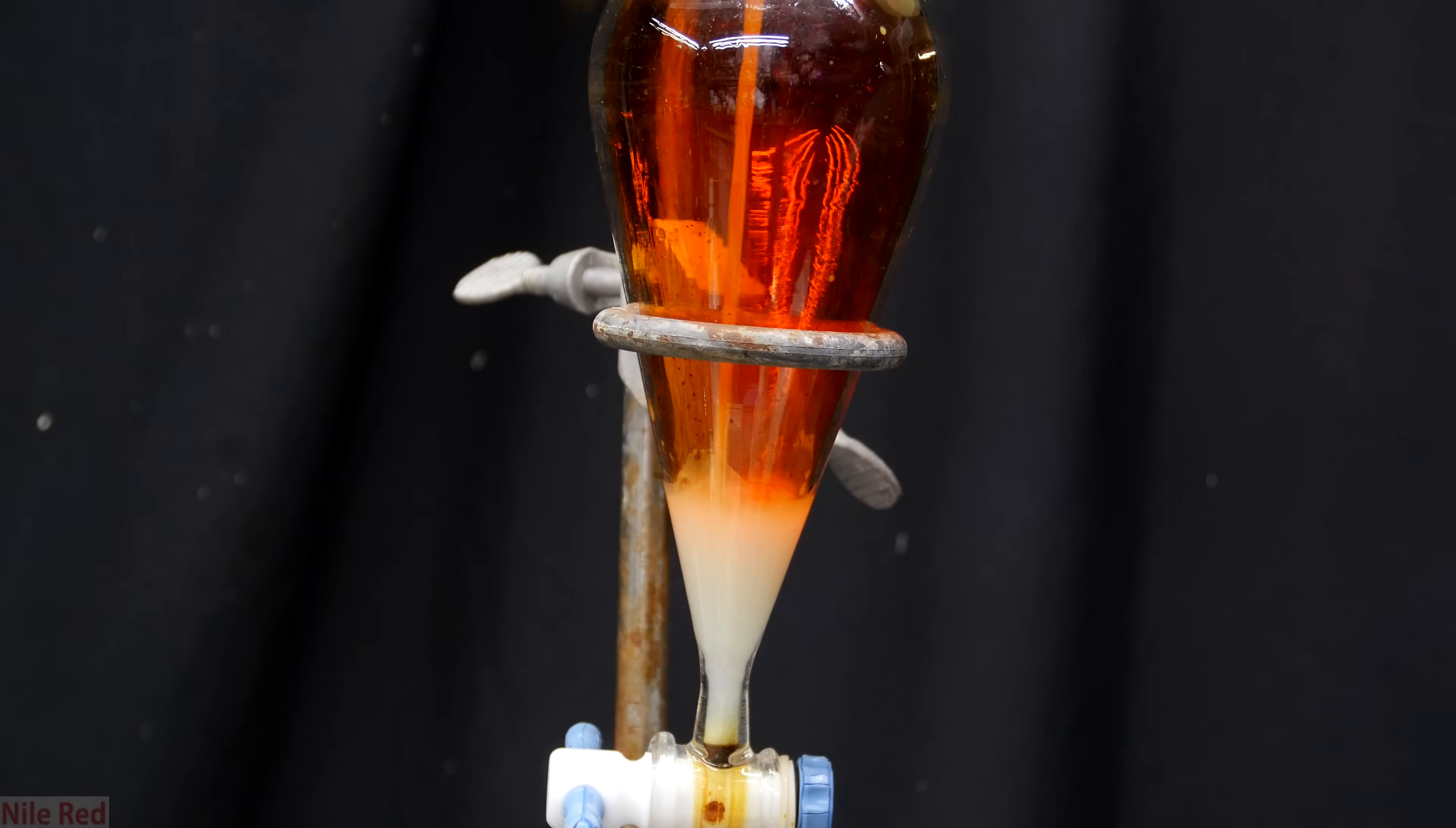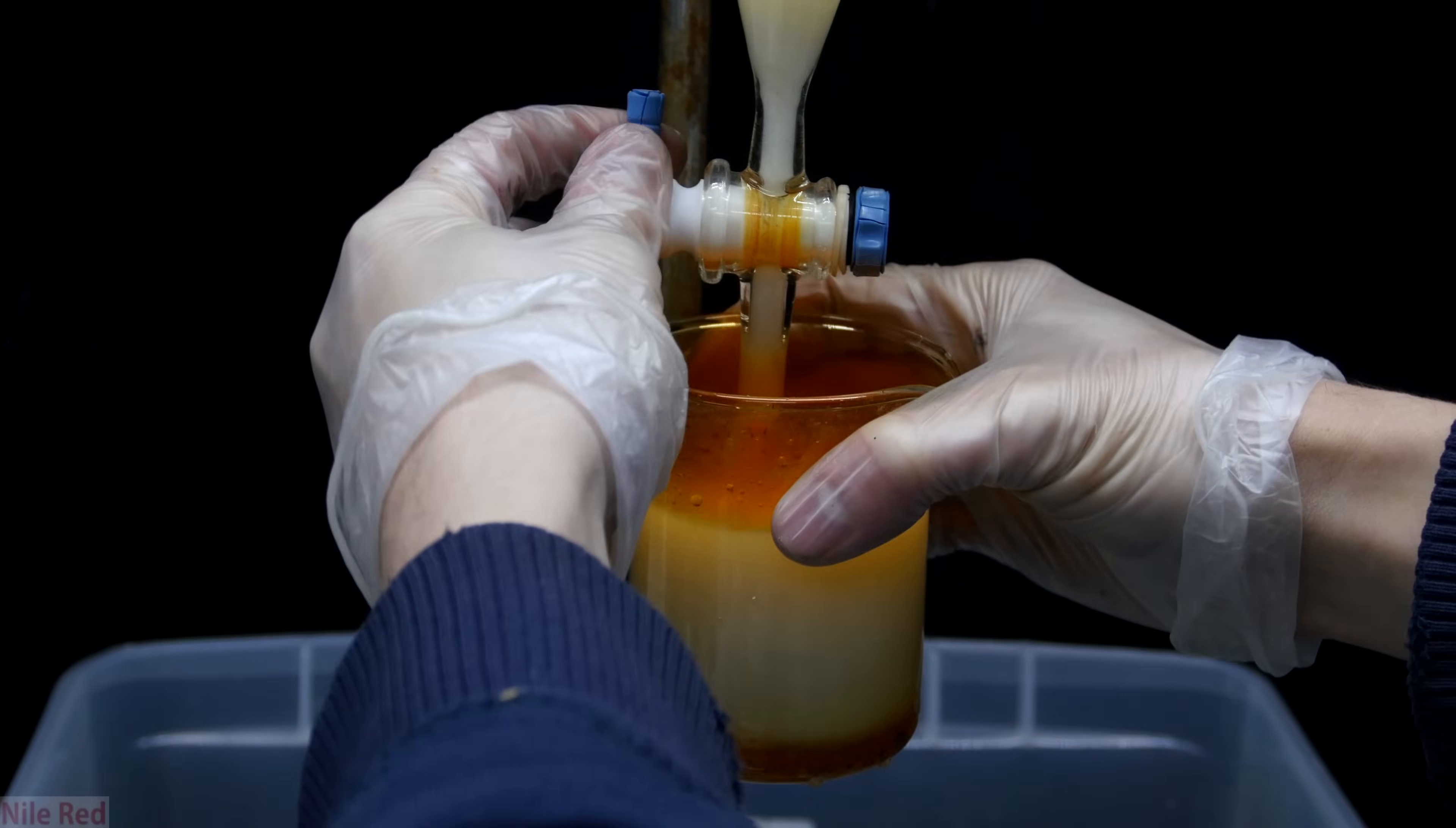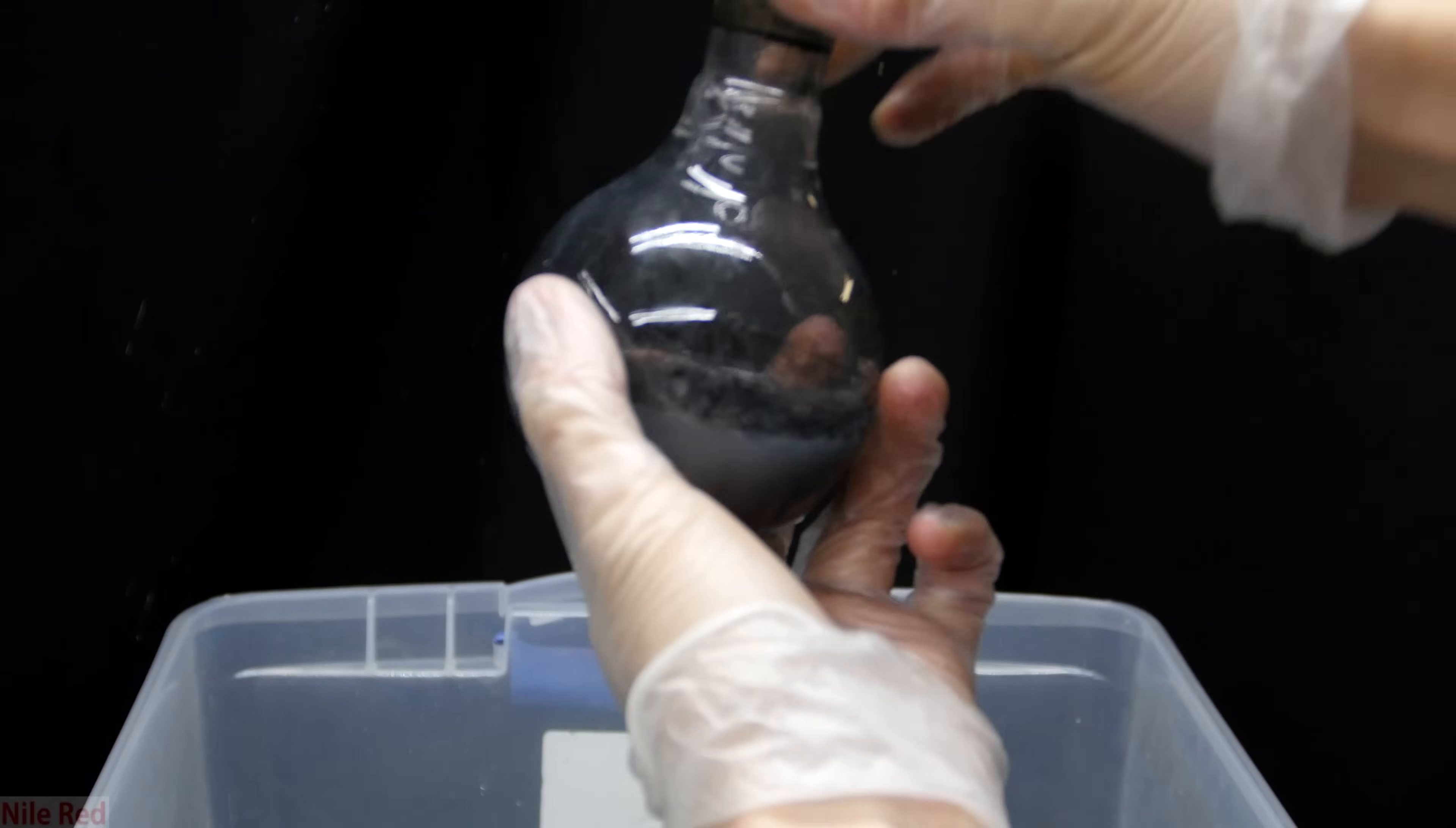To clean up the separatory funnel, I pour in some more solution of sodium thiosulfate. I forgot to mention it earlier but the reason the sodium thiosulfate solution becomes opaque is because it reacts with sulfuric acid to release elemental sulfur. The sodium thiosulfate solution in the separatory funnel is then drained into the beaker to neutralize any bromine that was in there. I also use some sodium thiosulfate to clean out the receiving flask that we used in the distillation. You can see that after a cap and shake it, everything becomes totally colorless indicating that all of the bromine has been neutralized.